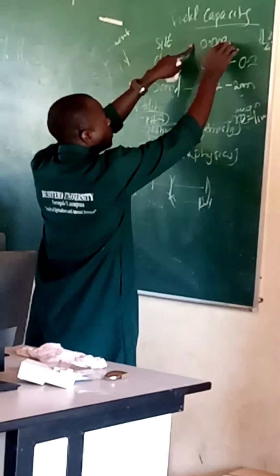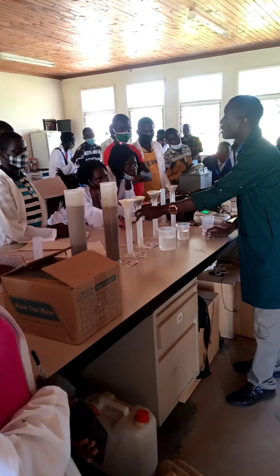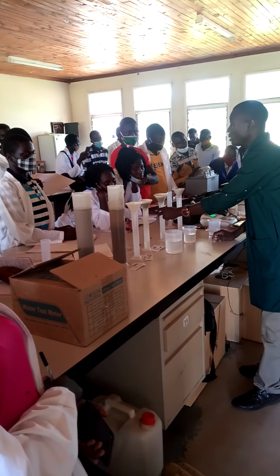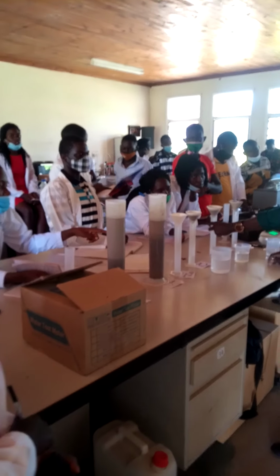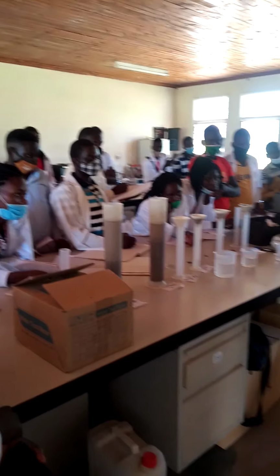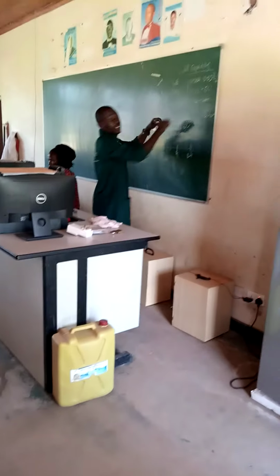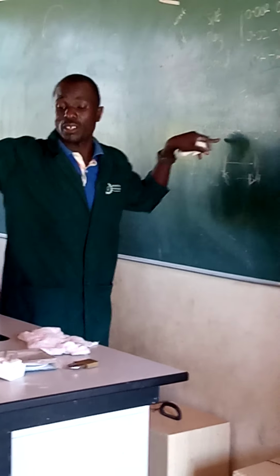Now, silt loam, it took how long? 8. How about this one? This is clay. Is it clay loam? And it took how long? Thank you very much. Now, when you have these ones here, you wanted this one to take a longer time.